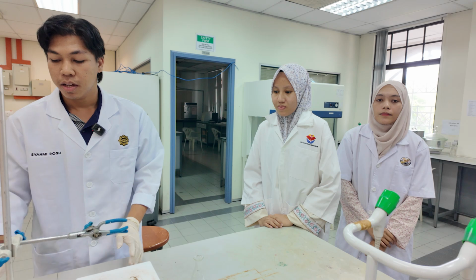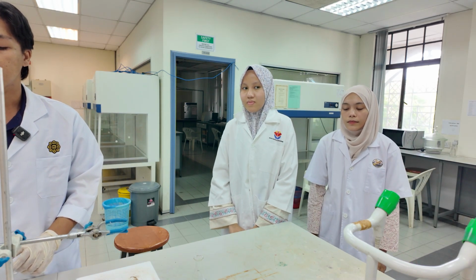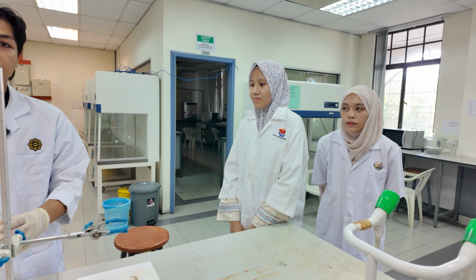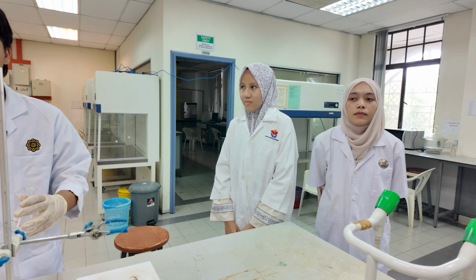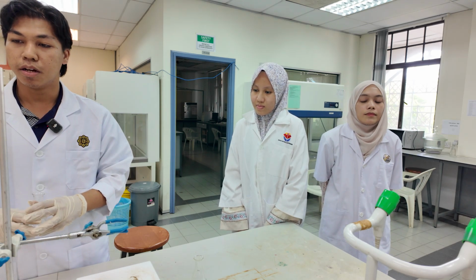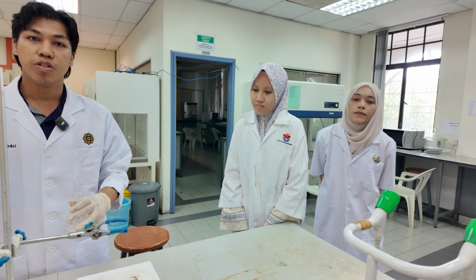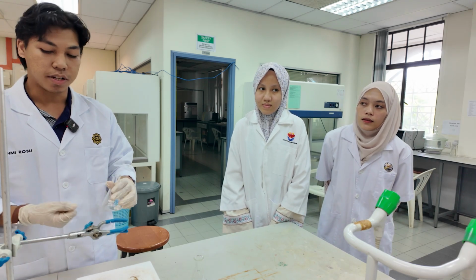When you scrape the leftover here, please be reminded not to put too much, because the crystal is slow to form. It will take some time, and if you put too much, it will take a longer time and maybe it won't crystallize at all. So it won't form anything below the conical flask.